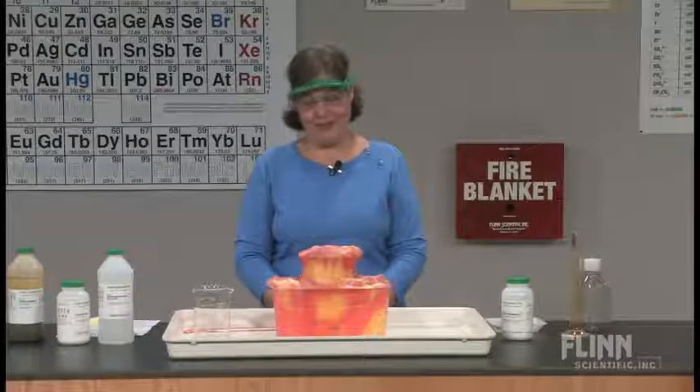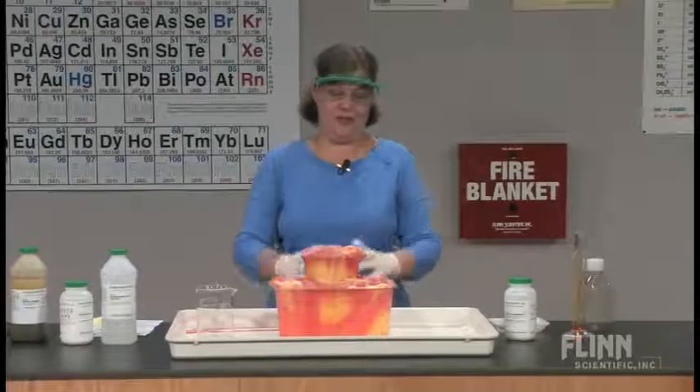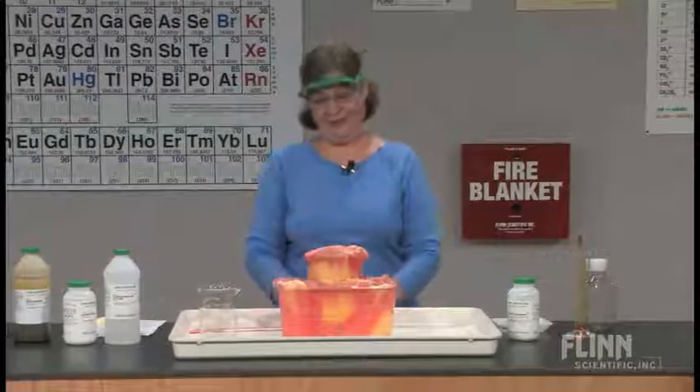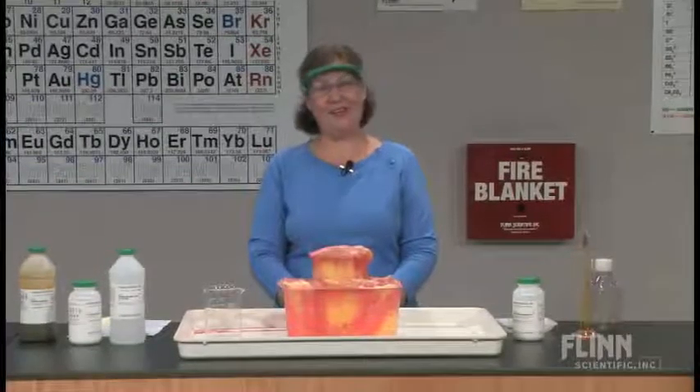You're actually going to see the colors go back to more or less neutral after the CO2 dissipates and all the neutralization has occurred. This orange juice to strawberry float demonstration comes under the heading of having a little fun with acid-base chemistry. It's a great one to do — there's so much volume and so many observations.